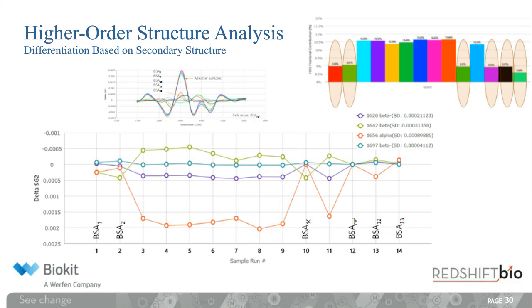And as a wrap-up, during this study, using microfluidic modulation spectroscopy, we were able to detect smaller than 2% structural differences for different BSA samples, thanks to the high sensitivity of the AQS3 system. And with this, I will hand the microphone to Dr. King.